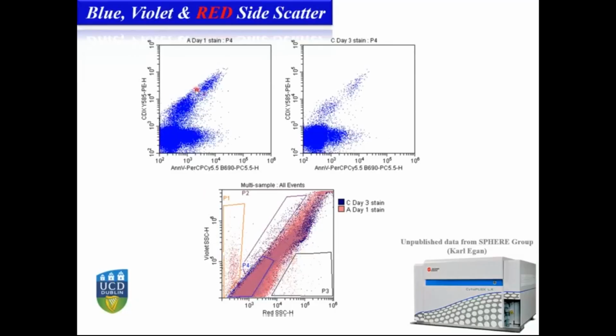That population, keep an eye here, looks like when we move to higher red side scatter, occupies the center position. So the expression of this marker is intermediate, and that makes this group of EVs slightly different, reflecting the light in different proportions of red versus violet.